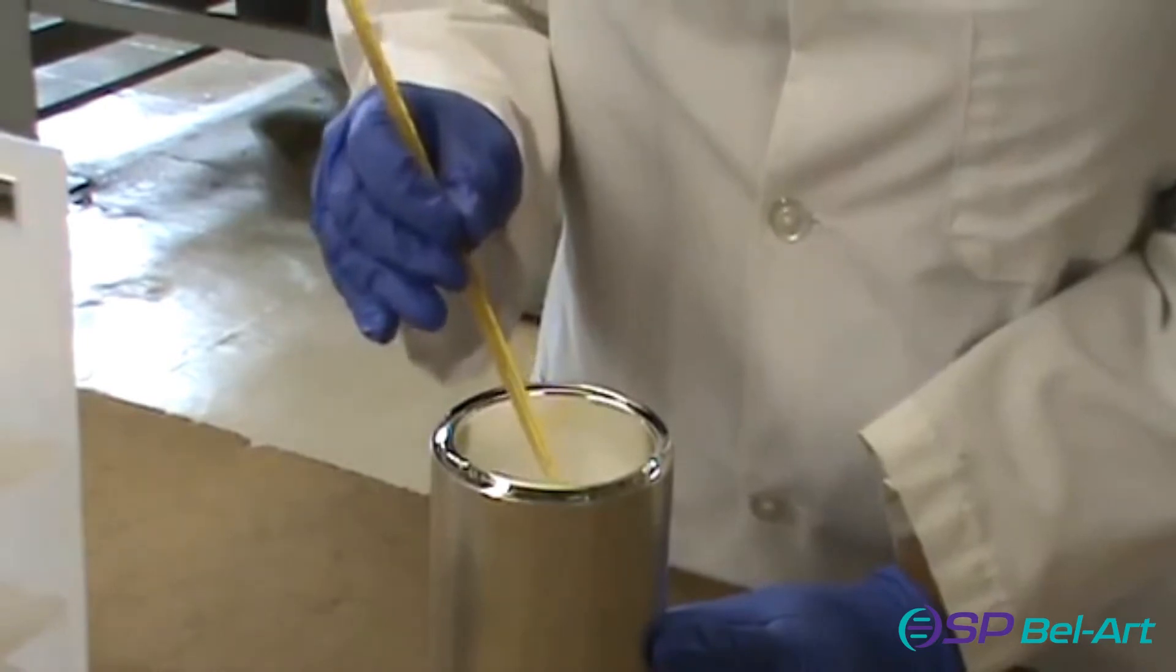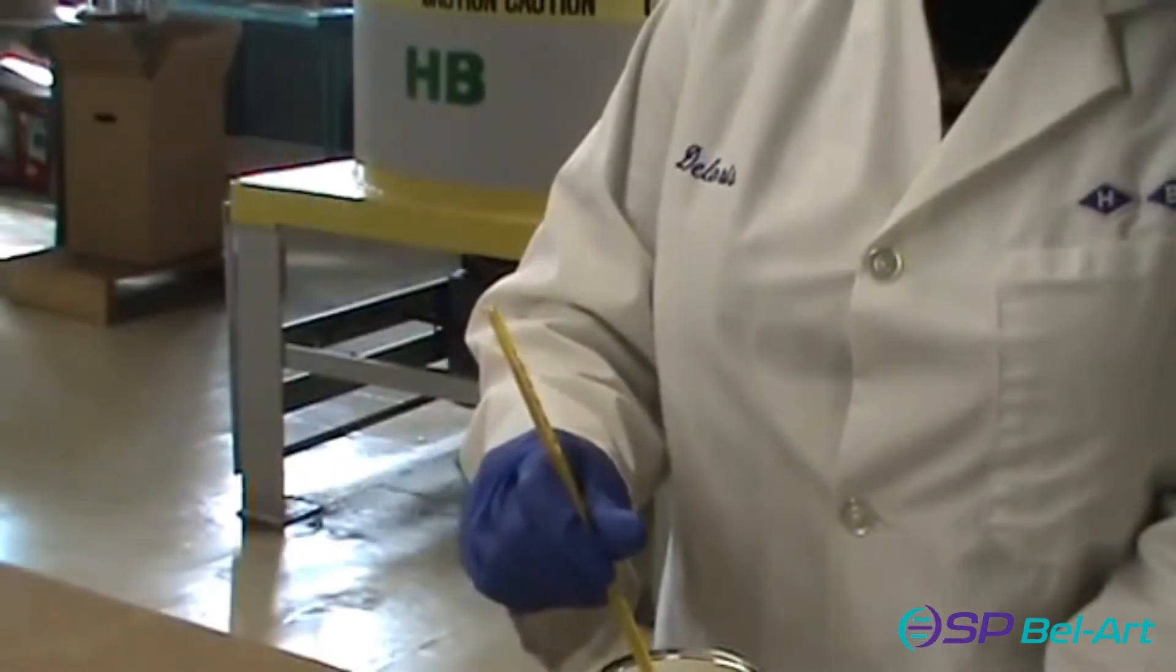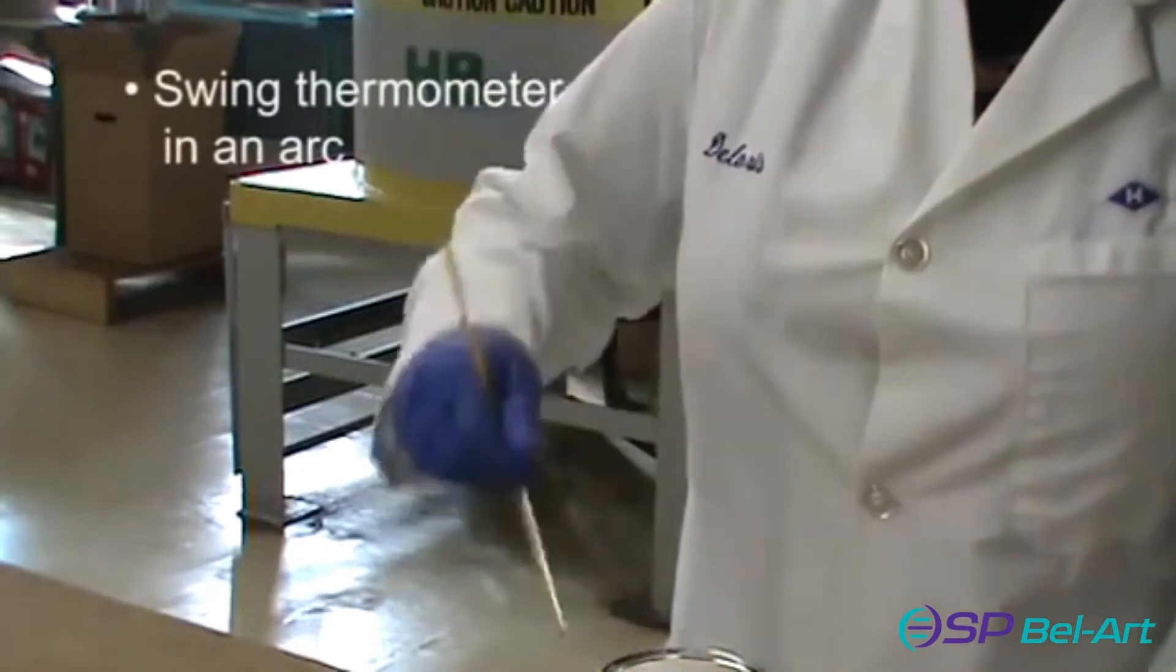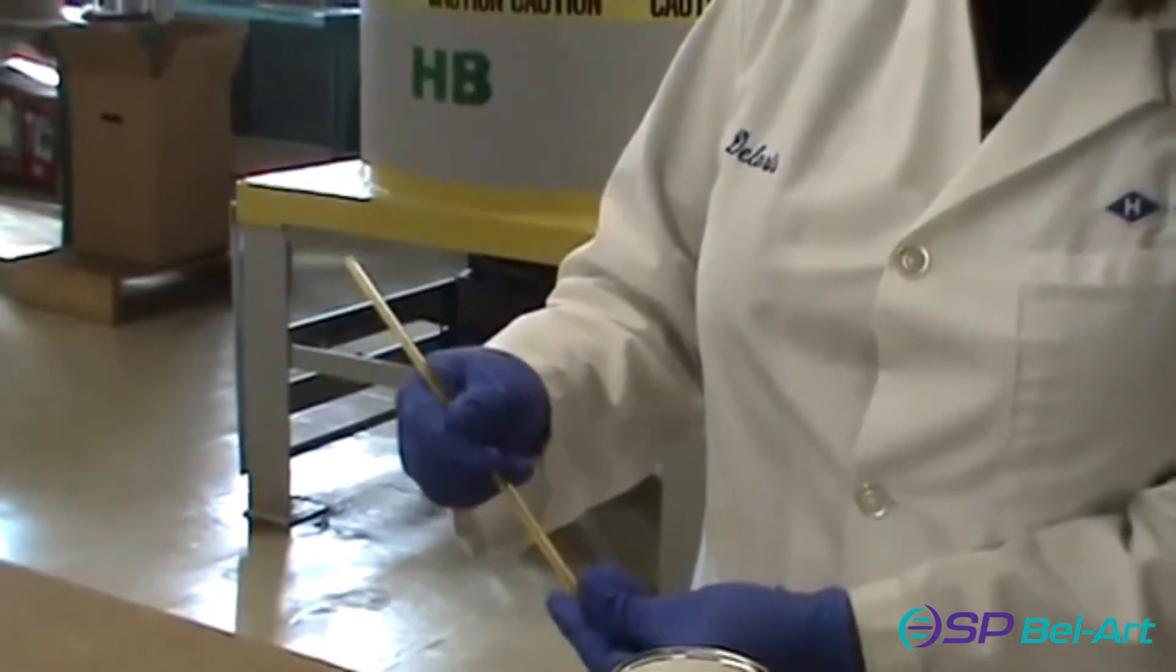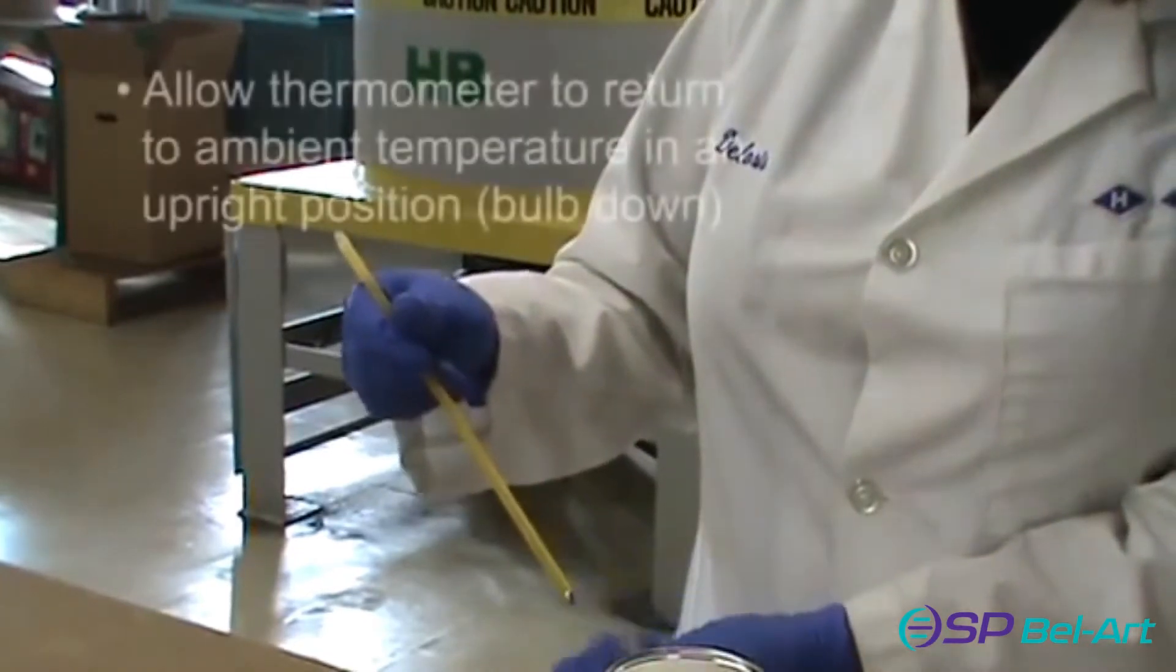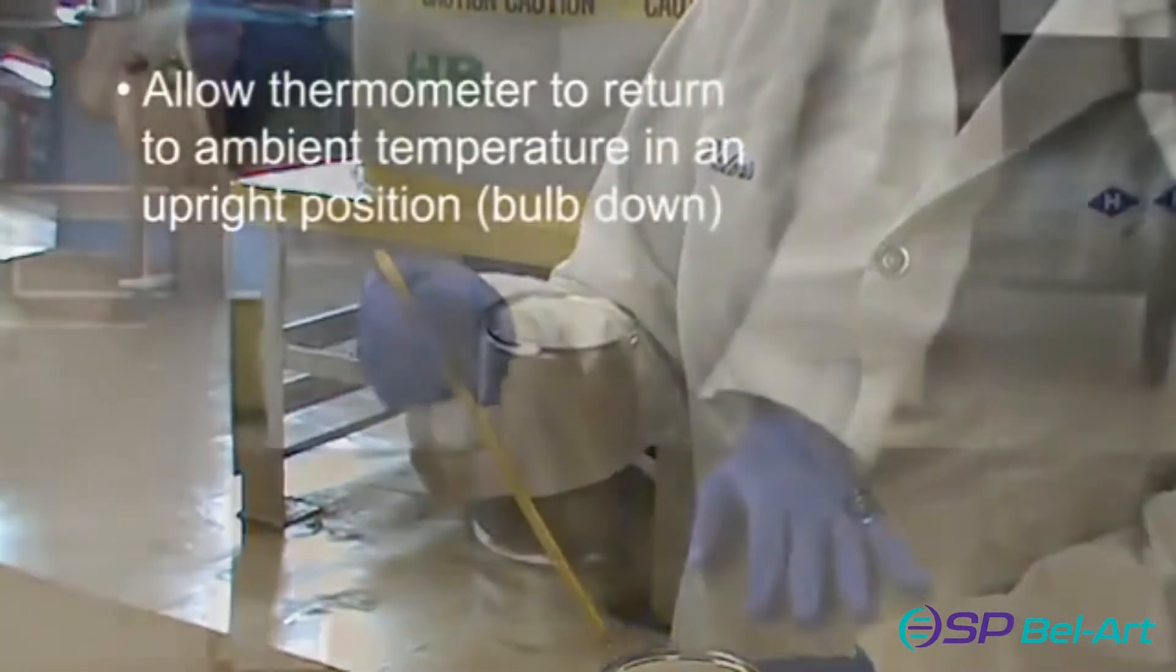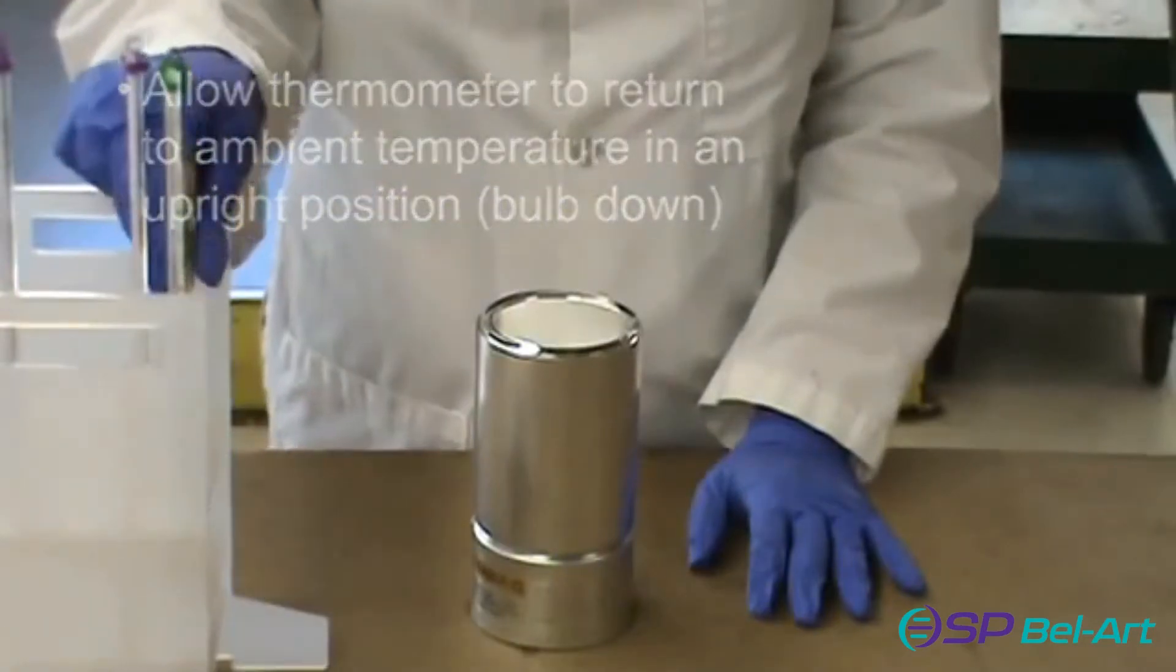Once all the liquid has retreated into the bulb, swing the thermometer bulb down in an arc, forcing the entire gas above the column. Allow the thermometer to return to ambient temperature in an upright position. Repeat until the separation has been reunited.